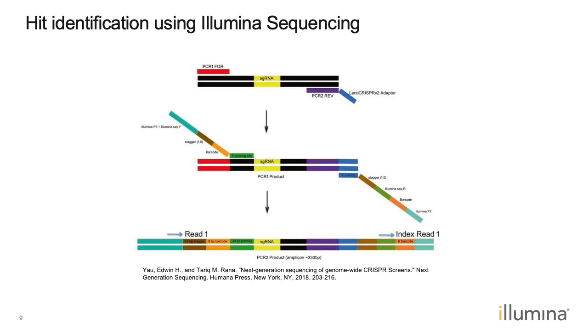And so typically you want a read depth of anywhere from 100 to 1000x per guide RNA sequence, depending on the type of screen. And so negative screens may require more sequencing depth than positive screens because you are looking here for the absence of guides. And positive screens may not need to be sequenced as intensively or as deeply as negative screens.